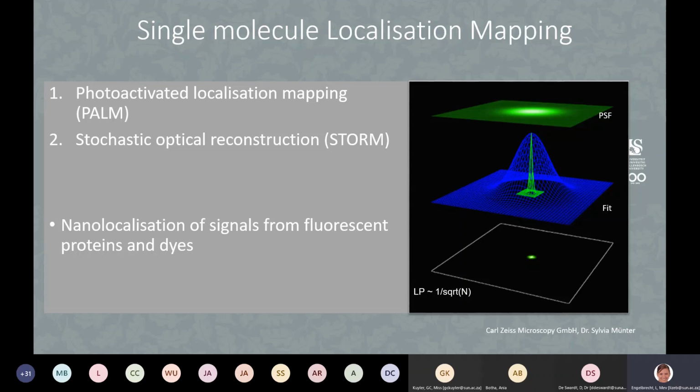The problem with resolution comes in if you have thousands of molecules in your sample, your point spread functions start to overlap and you don't only have nice round circles anymore. And that's the problem with localizing it from a confocal image. So now the solution is not to have all those thousands of molecules on and fluorescing at the same time. Our chemistry partners in microscopy have developed ways in which they can switch between an on state and an off state of a fluorochrome. The idea would be that you switch on only some of the fluorochromes at once, and they would each have their circular point spread function, and the microscope would record their position. Eventually they need to switch off, and another set of fluorophores need to switch on.